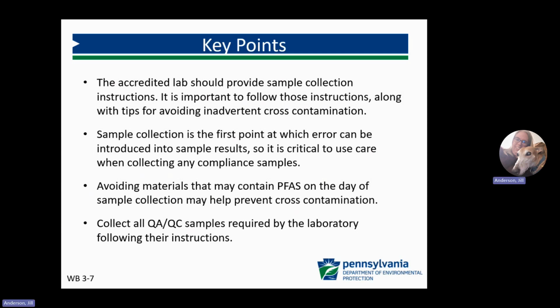Sample collection is the first point at which error can be introduced into sample results, so it is critical to use care when collecting any compliance samples. Avoiding materials that may contain PFAS on the day of sample collection may help prevent cross-contamination. And collect all QAQC samples required by the laboratory following their instructions. The next lesson in this course is Lesson 4, Compliance.